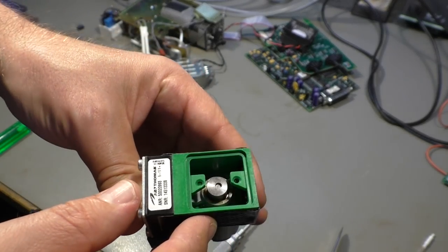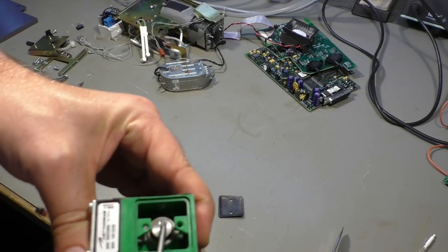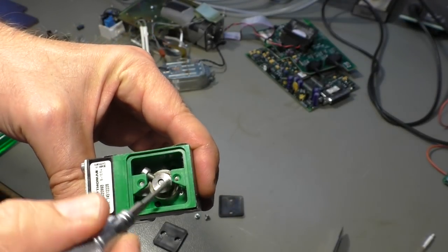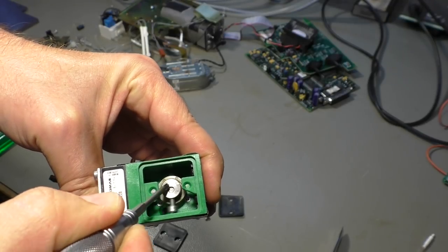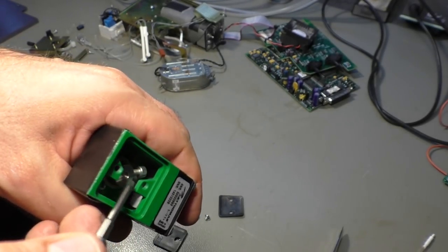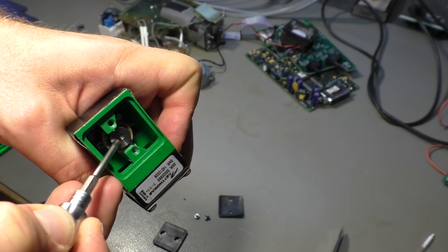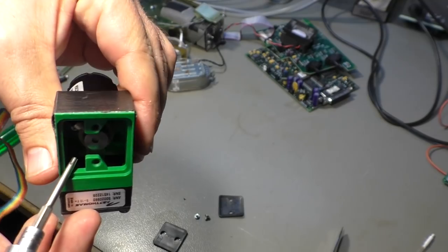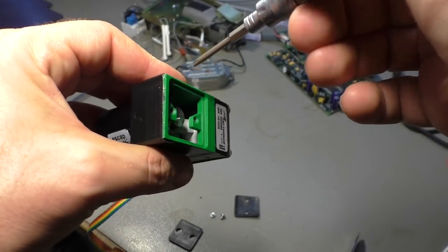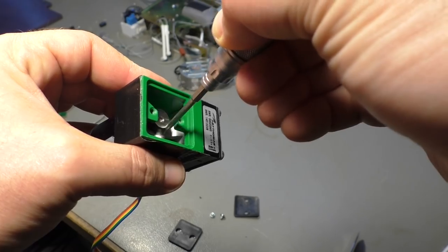Okay, we see something like a crankshaft and a push rod. Yes, I think. I hope you can see that too, that the outer ring here is going up and down eccentrically. And that pushes on the piston down here. Let me adjust the light. Yeah, it's a bit tricky. Where are you? You are here. I have to look through the camera. Can you see it? Piston goes up and down.